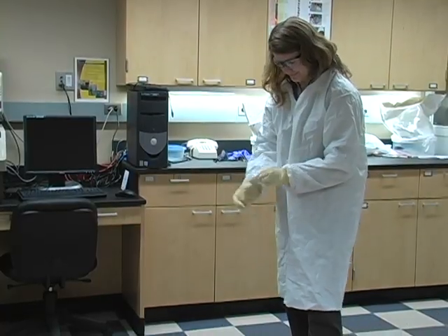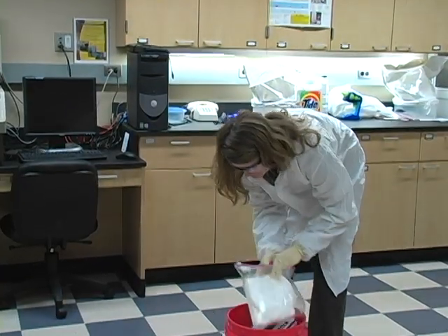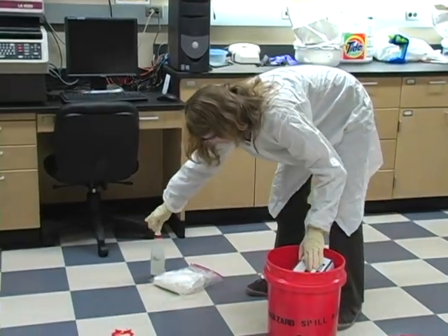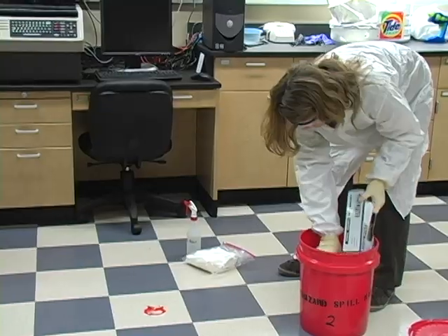If there are any sharps around the spill, pick them up with either tongs or tweezers and place them in a sharps container. Just be sure to use something that will effectively separate your skin from the sharps.